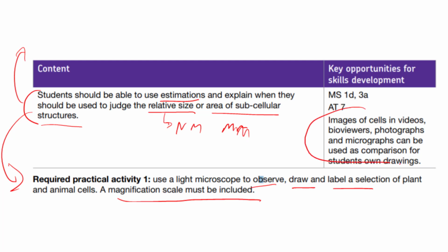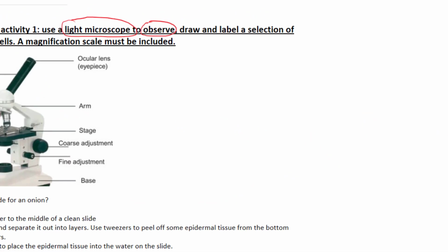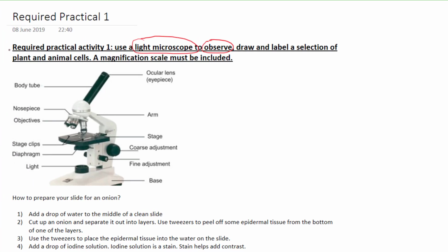And this bit here is just when you go to draw your drawings, the teacher will be showing you comparisons of how your drawing looks to someone else's drawing of the same thing, and you have to have the ability to draw it yourself, the thing you actually see. So going to the actual required practical, let's look into it in more detail. So we have a few things.